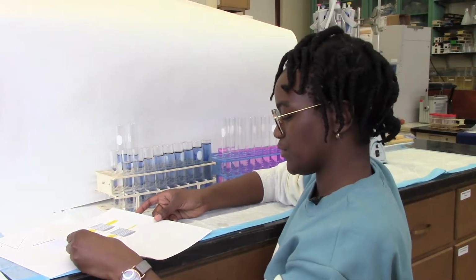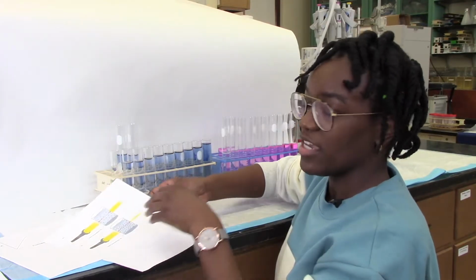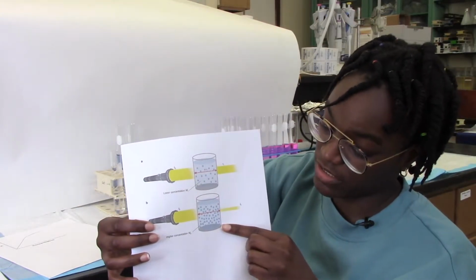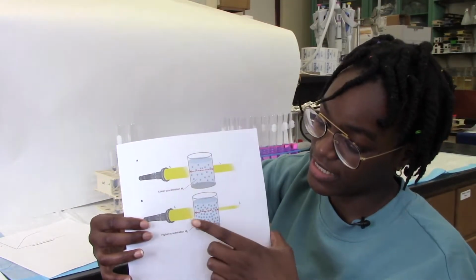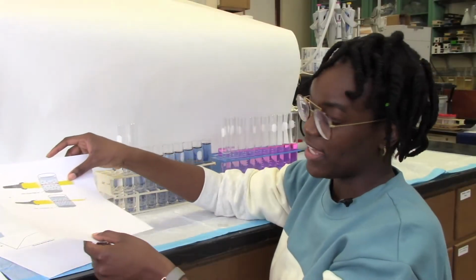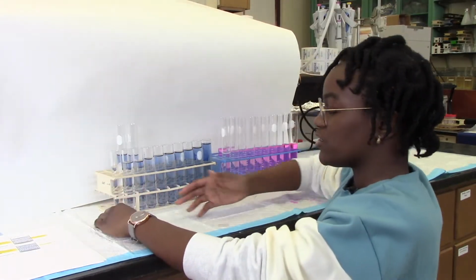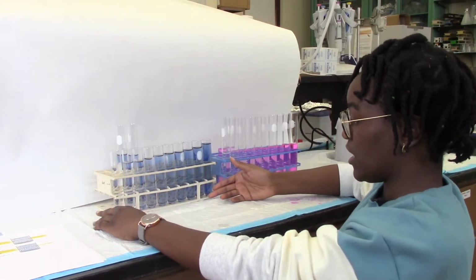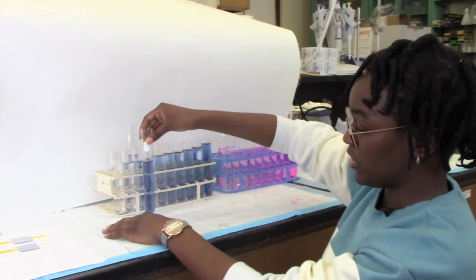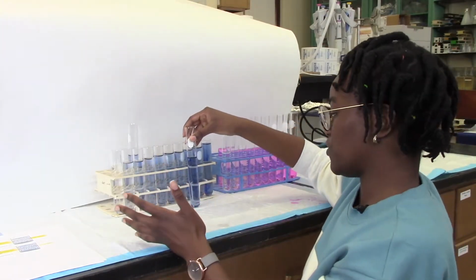One of the most important principles of spectrophotometry is Beer's law. In Beer's law, we're looking at the concentration within the solution. And the higher the concentration, the less light will be able to pass through it, as we can see in these diagrams. So before we had the current technology today that allowed us to analyze it, they had to use a known range and then compare an unknown to see what the concentration was within the solution. As you can imagine, this was very time-consuming and difficult.